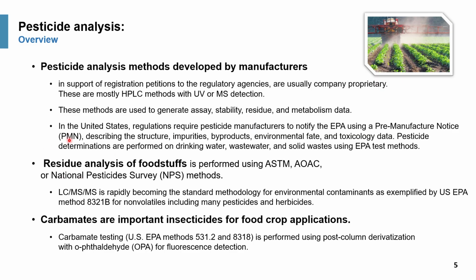So here it describes the structure of the new pesticide or herbicide, the impurity profile, byproducts, its environmental impact or environmental fate, and tox data for birds, fishes, and other animal impact.